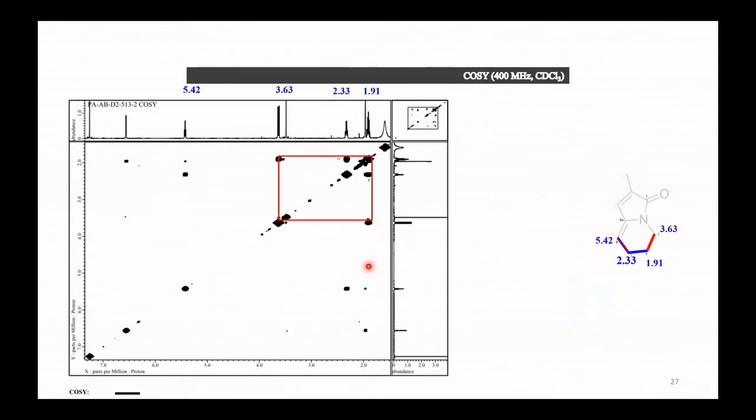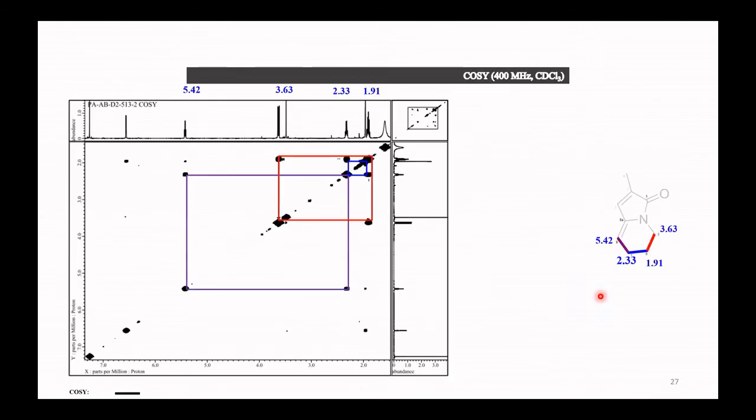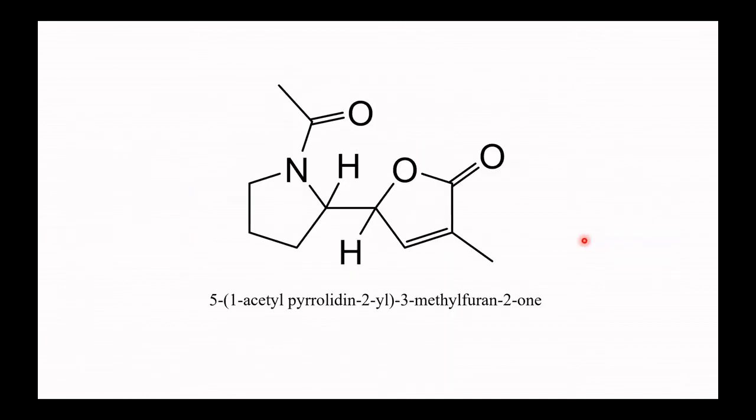If you go to the proton spectra, correlation first of the two adjacent protons and the correlation of the next adjacent protons, but the others, you will not see any correlation because there is no proton here. Also this, no proton here. So you see only the correlation if two protons are adjacent to each other. That's why we call it H COSY. But if you have proton here, but you don't have proton here, then you don't see these two correlations, right?